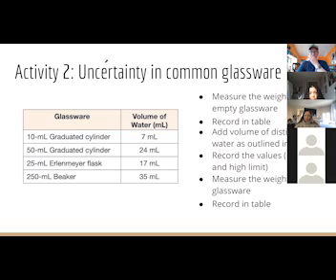Basically, you're giving an error estimate. So you're saying, you know, it's going to be 35 mils plus or minus 10 maybe. And then you're actually going to measure the actual mass of that water and see if you're right. Is it within that interval? And I bet it is, especially if you give yourself a huge interval. If you say it's plus or minus 35, then yeah, I'm pretty sure you're going to get that. But you should be able to measure it more accurately than that.